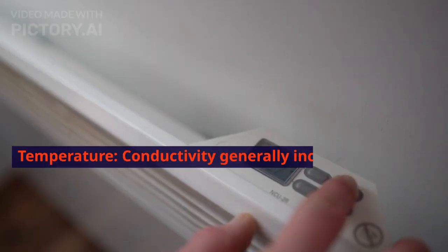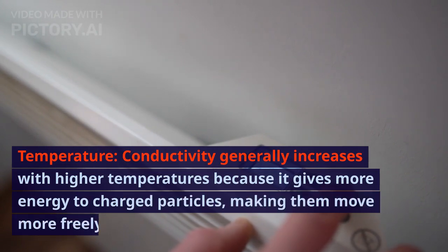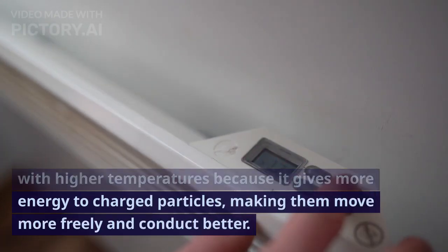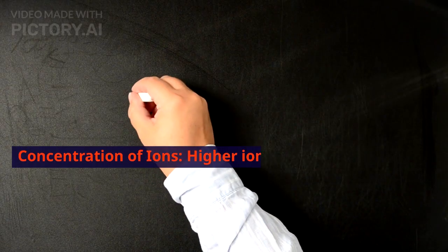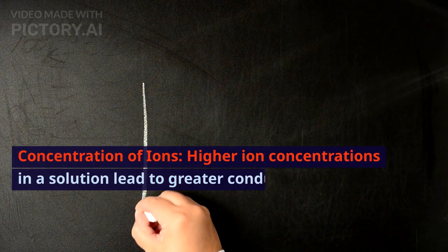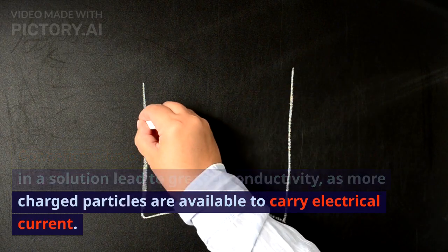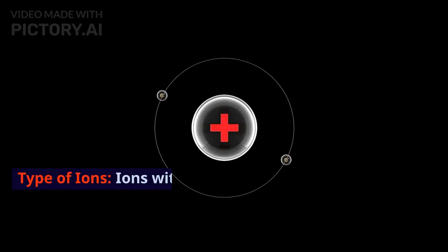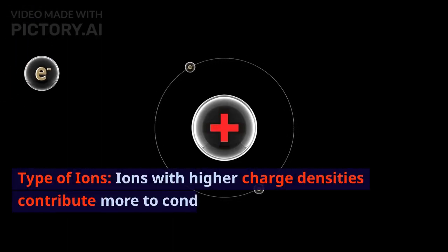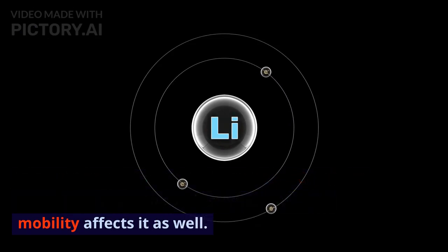Part 4. Factors affecting conductivity. Temperature. Conductivity generally increases with higher temperatures because it gives more energy to charged particles, making them move more freely and conduct better. Concentration of ions. Higher ion concentrations in a solution lead to greater conductivity, as more charged particles are available to carry electrical current. Type of ions. Ions with higher charge densities contribute more to conductivity, and their mobility affects it as well.